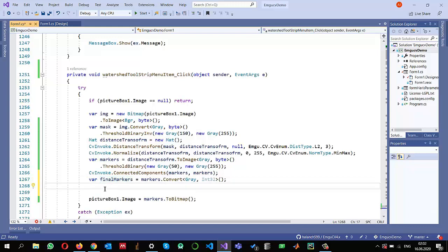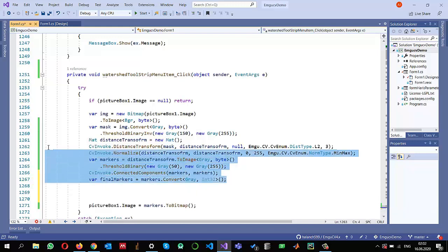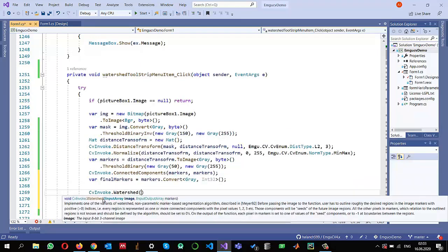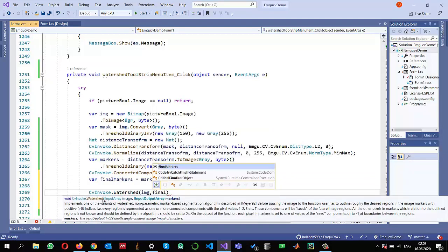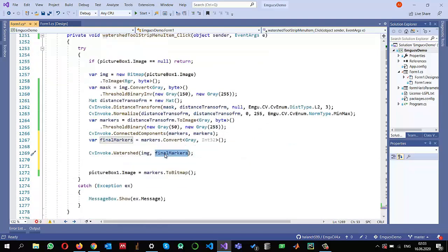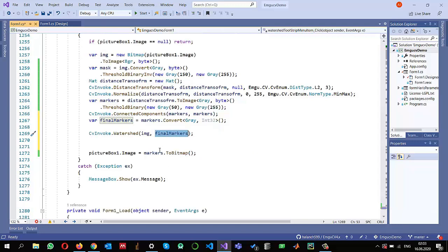Most of the work so far was just preparation of the markers. Now I call `CvInvoke.Watershed`, passing the original input image and `finalMarkers`. After this call, for every segmented area, the pixel value on the boundaries will be set to minus one — that is an important piece of information I will use to draw boundaries around the objects.